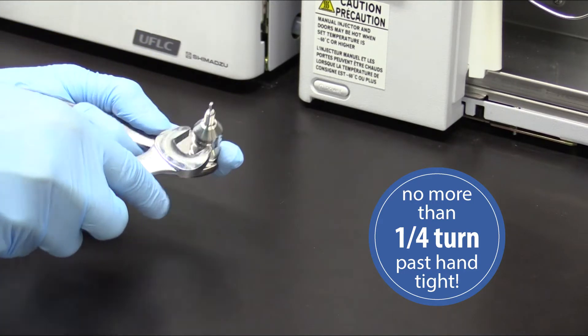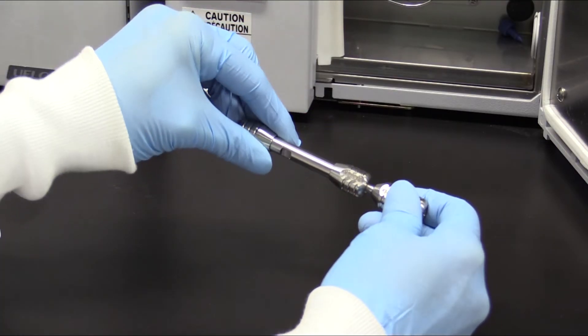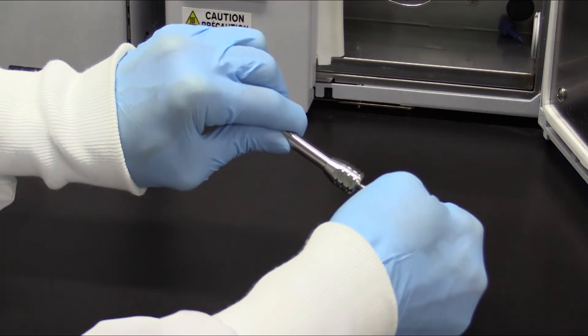Again, when you're installing this completed guard system onto the column, make sure you do hand-tight only, never a tool. We hope this cleared up the Trident guard system for you.